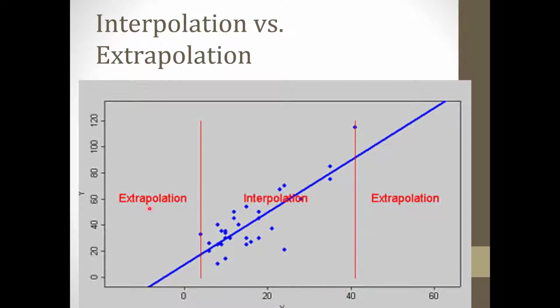So for example, if you know that the y-axis is 60 for the unknown concentration, you can draw a line straight over to the best fit line and straight down, and you'll know what the x-axis should be for that unknown. Or even more accurately, if you know y, you can solve for x in the equation of the line, y equals mx plus b. You can solve it that way.